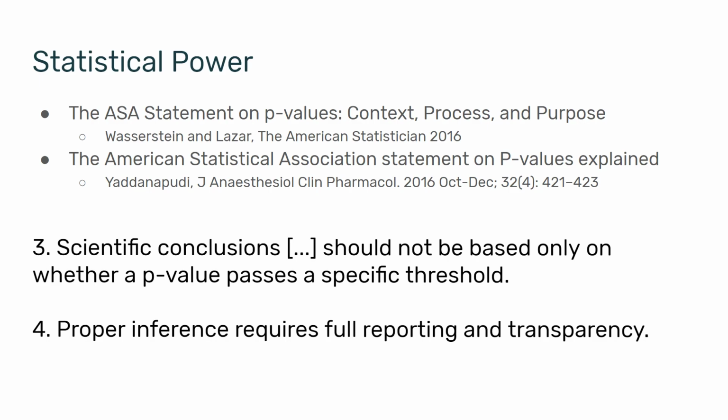If your p-value is 0.03, just report it as 0.03. If it's 0.7 or 0.15, just report it as 0.7 and 0.15. By the way, I've seen at least one cytometry paper explicitly using these as a reference to explain why they're still reporting the results even though the p-value is higher than 0.05. It's still interesting, it's still important, it is still biologically meaningful, even if it does not pass a statistical significance threshold.